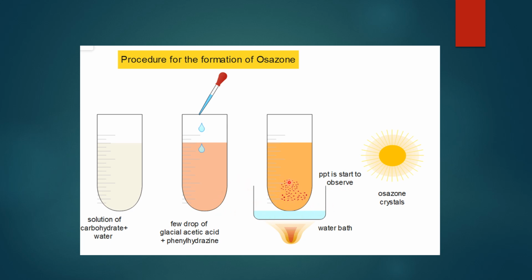You can observe the crystals starting to form at various times. This is the crystals at the end of the test.